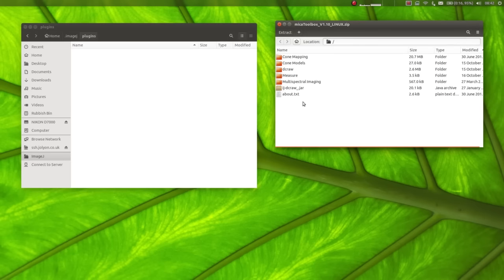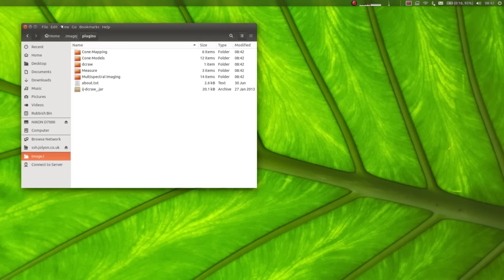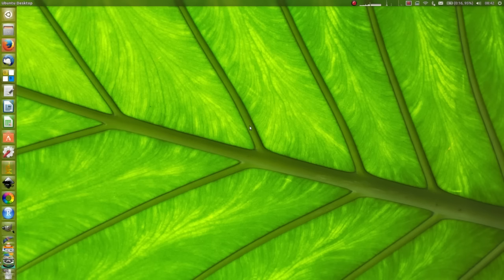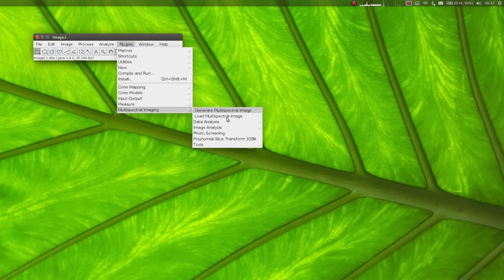So all we need to do is select all of the files in the zip here and extract them. You can just drag them across. And that's it. That's the toolbox installed. Now if we start ImageJ and click plugins, you'll see that the multispectral toolbox tools have appeared here.